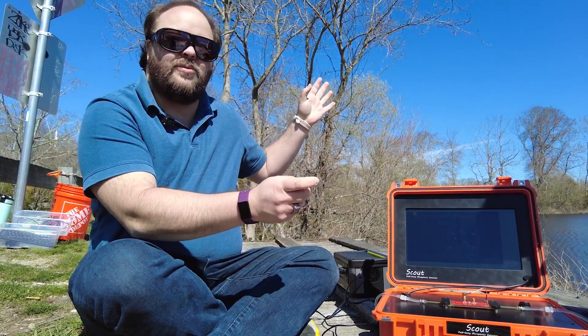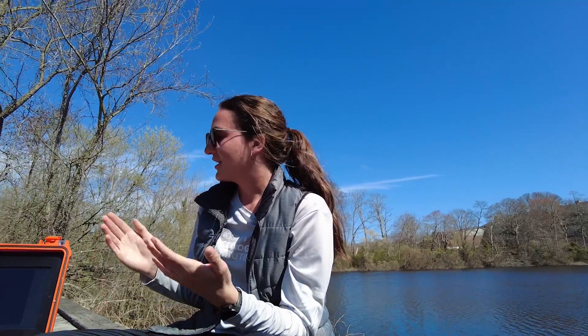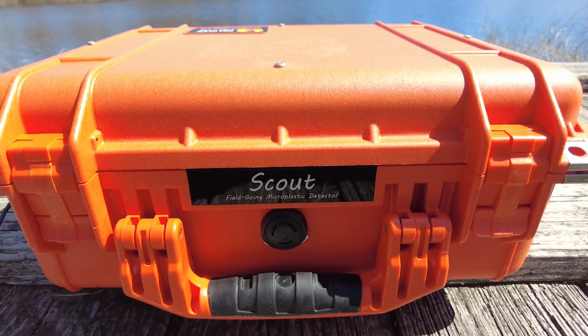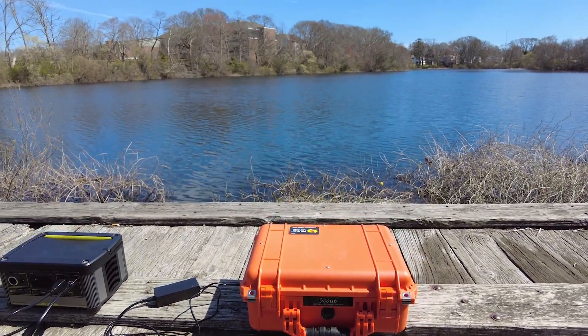This is real-time and portable — we can bring it out in the field and get our data right away. We can give not only scientists but also the general public access to study microplastics in their water, whether that's drinking water or water out in remote locations. We are hoping to make the future version of this both smaller and cheaper so that we can get it out to all sorts of people around the world.